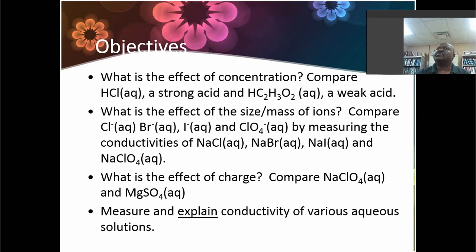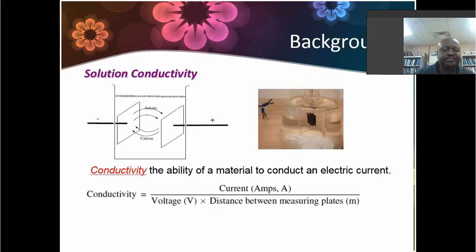Orange juice. So there are some everyday products. You measure the conductivity, and based on the number that you get, you reason what is in there that's leading to this particular conductivity. So there's a lot of inferred reasoning that you're going to do in this lab.